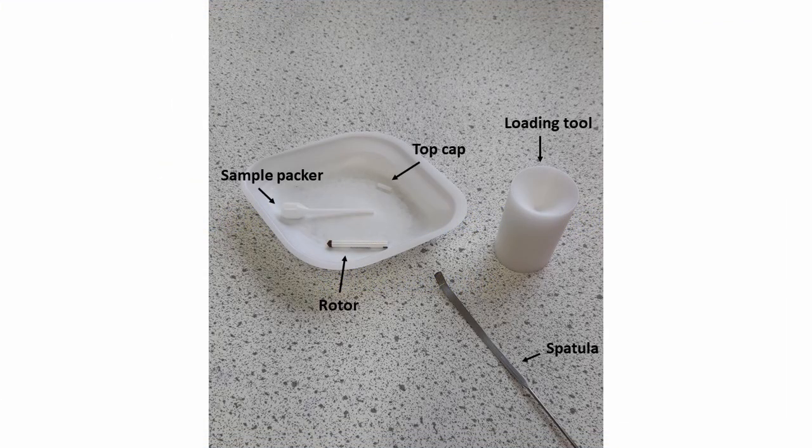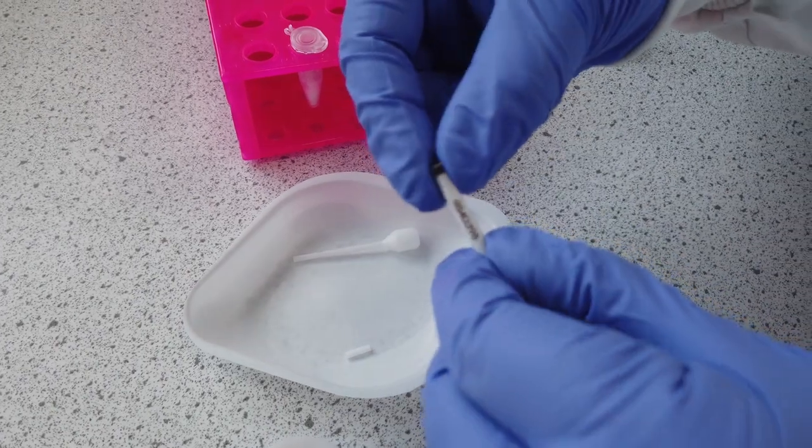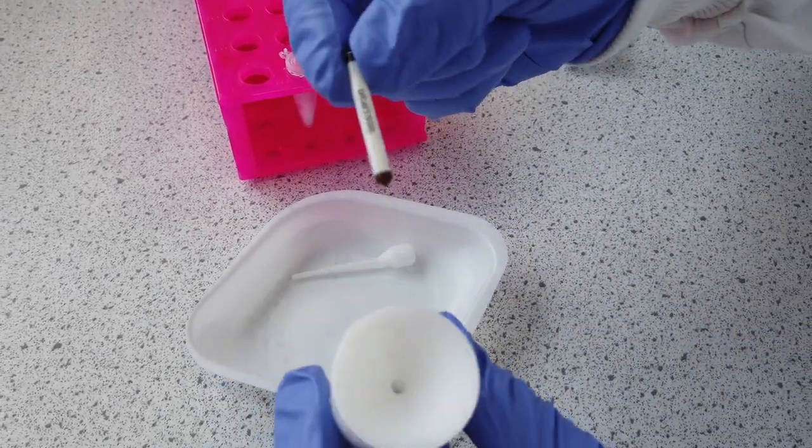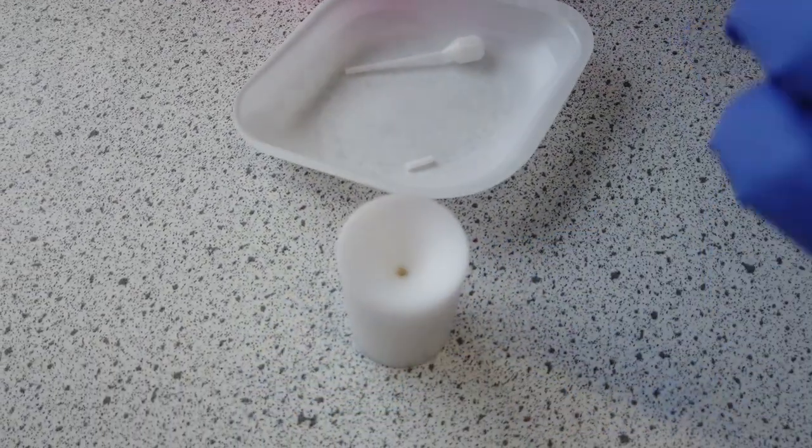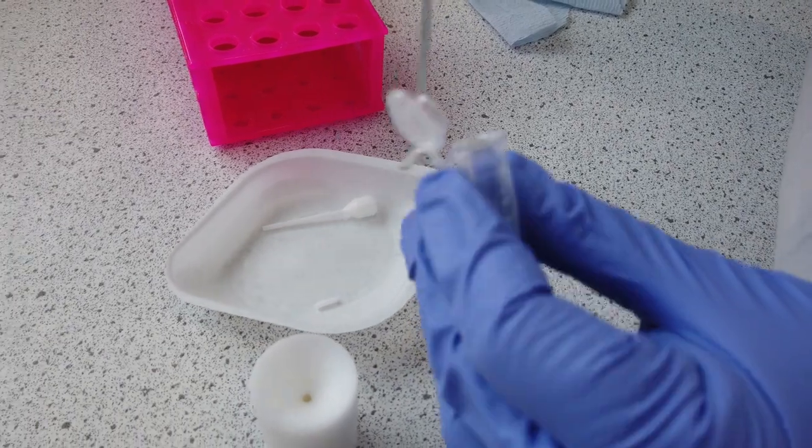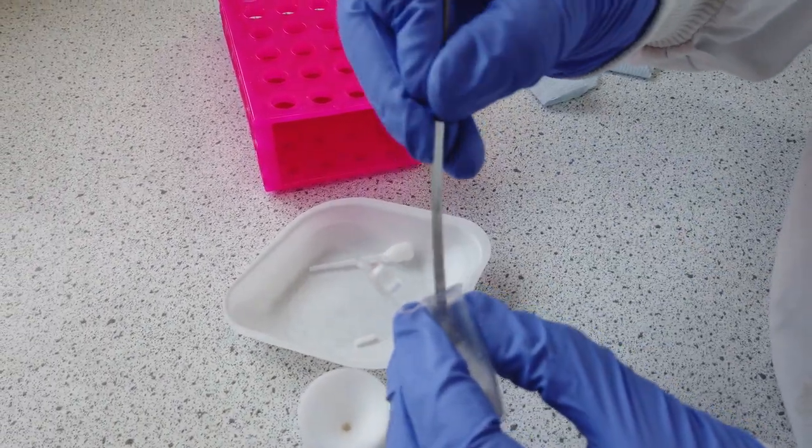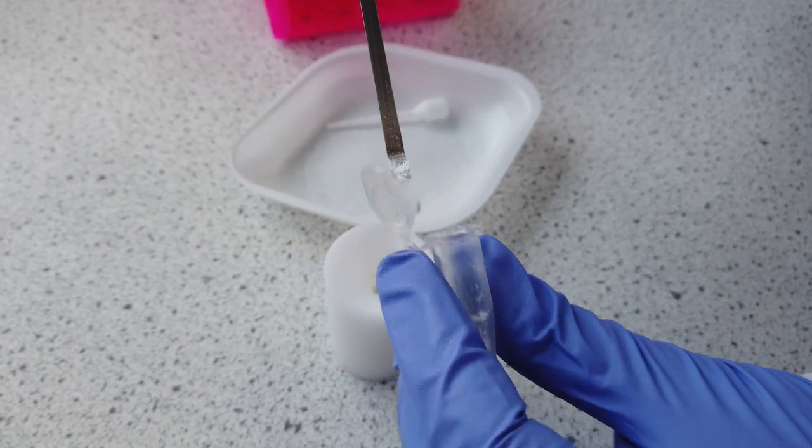To prepare for loading a solid sample, you need a loading tool, sample packer, empty rotor, a small spatula, and of course your sample. Place the empty rotor into the loading tool tip down. Add a small amount of sample and use the sample packer to push the sample all the way down to the bottom of the rotor, making sure it is tightly packed.